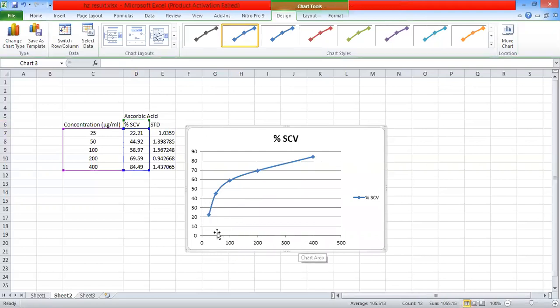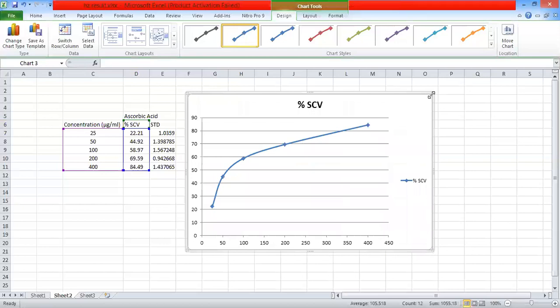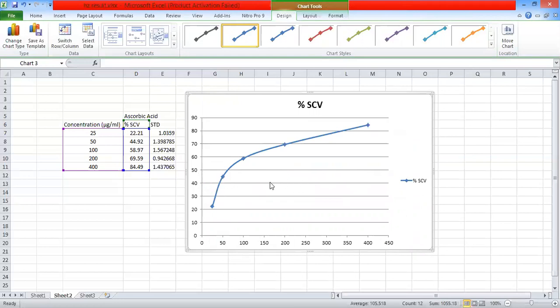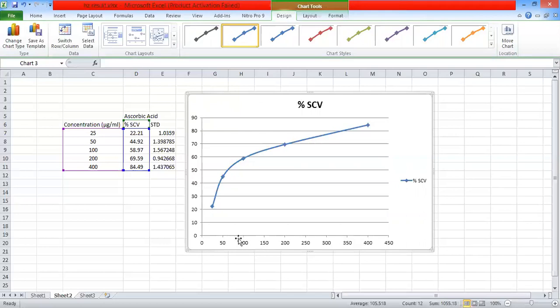This is the concentration and this is the percent inhibition. For our intended purpose, I am enlarging this graph and I'm going to add major and minor grid lines. You can see the grid lines added for the X axis, and I am going to add Y axis major and minor grid lines to this graph. To do this, I have to choose this particular concentration region.